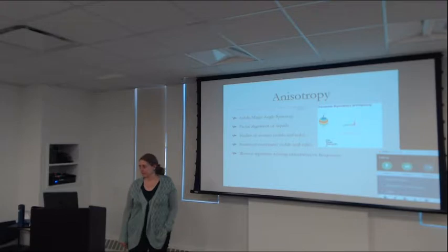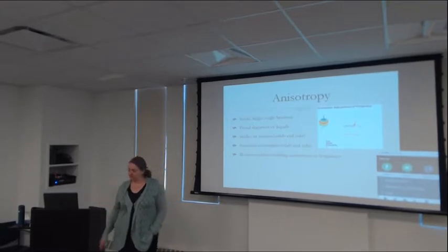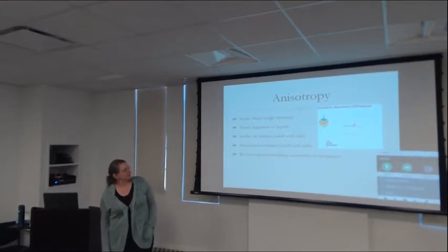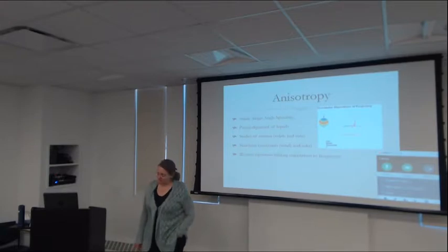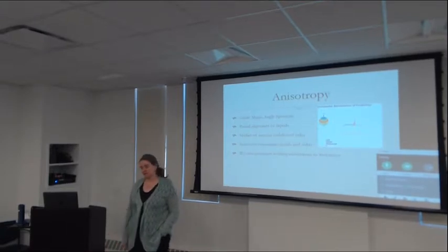That's not the first thing we're going to talk about. That will be in the second half of the class. Relaxation, chemical exchange in principle. But here again, it's a little different, solids versus solution. And then there's one extremely important orientation-dependent interaction, the dipole coupling, that gives us arguably our strongest constraints on structure from NMR.